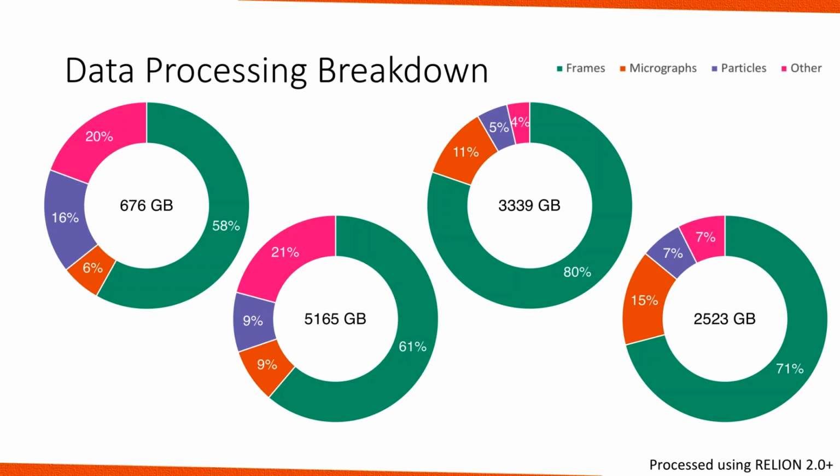So in general, just looking at these footprints, I'm not going to really speak more on them, but I think about 25% preparation of extra data is a good average. By all means, treat that as a minimum, because it seems to be close to the minimum. Users can generate, I mean, the sky is the limit.